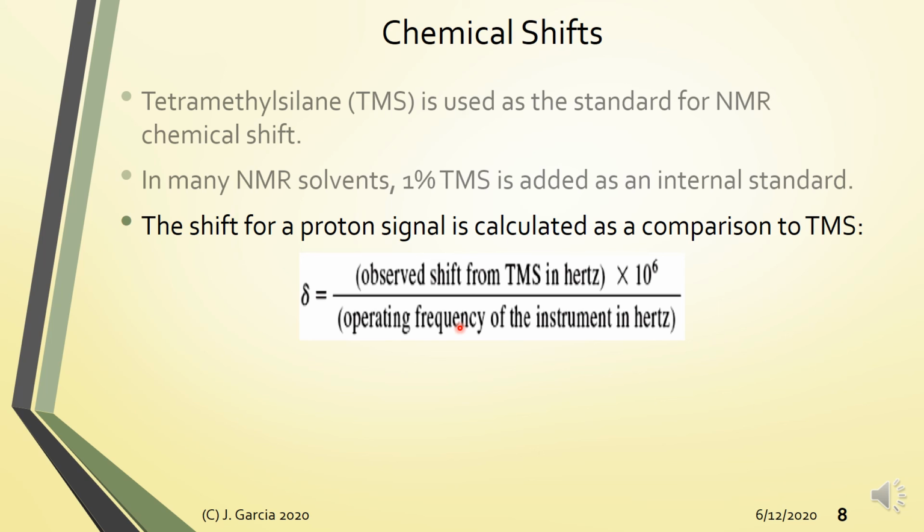In NMR spectroscopy instrumentation, resolution is a measure of the degree by which an instrument can differentiate between two adjacent signals. So the better that you can separate or discriminate two adjacent signals from each other, we say that the instrument has a better resolution.